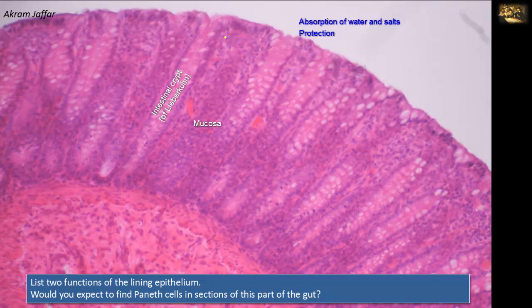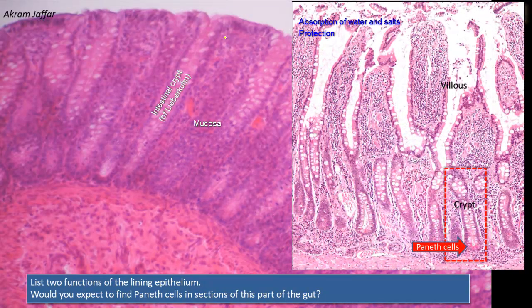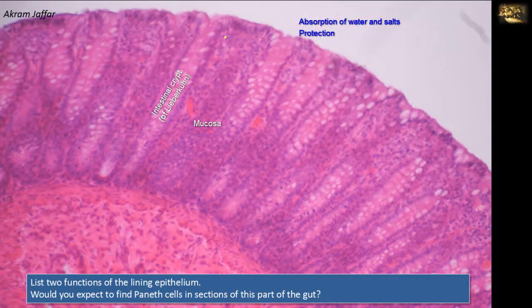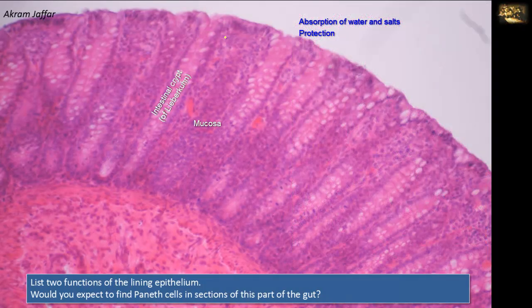Would you expect to find Paneth cells in the large intestine? Paneth cells are characteristically located at the base of the crypts of the small intestine. They have prominent eosinophilic apical granules and secrete enzymes with antimicrobial action. They are a feature of the small intestine, but a few may be found sporadically in the cecum or appendix. If this section is the cecum, there is a possibility of finding Paneth cells at the bottom of the crypts. Otherwise, Paneth cells are present in the small intestine.